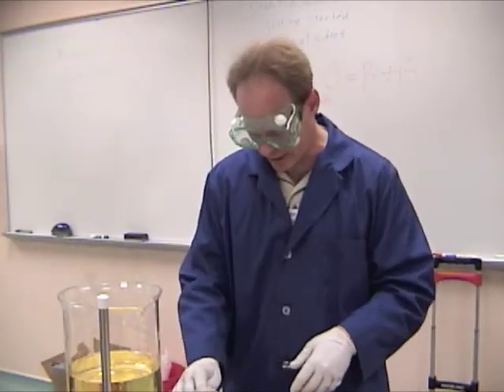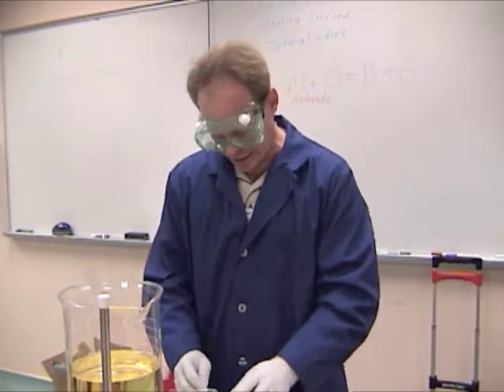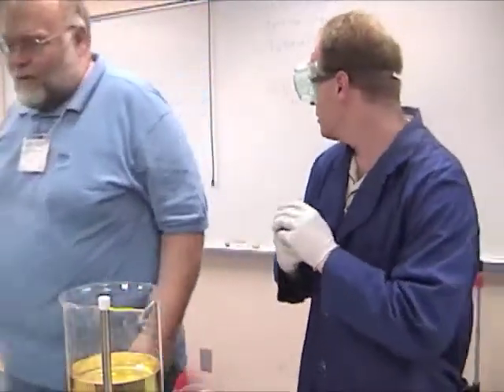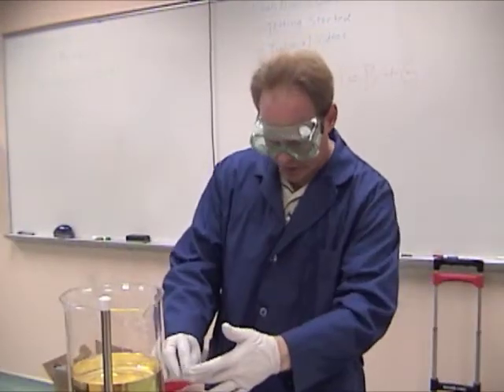So what I've got up here is just a little scale. I've got this tared, which means I've zeroed it out. I'm going to put 7.5 grams.